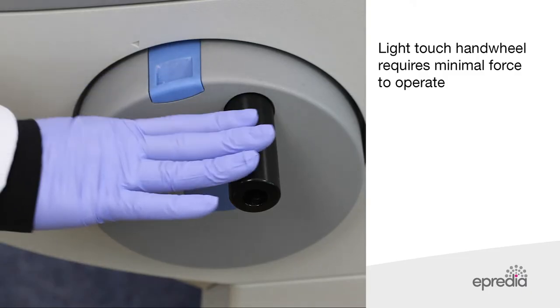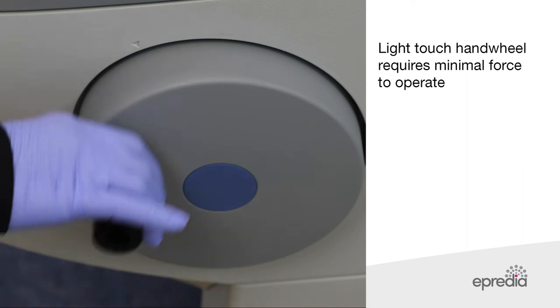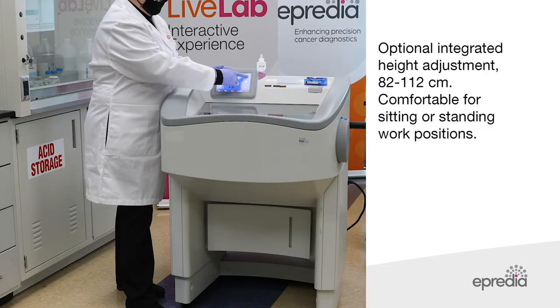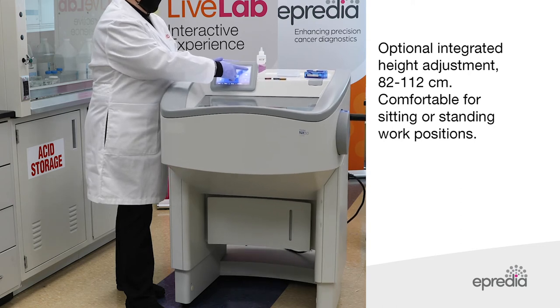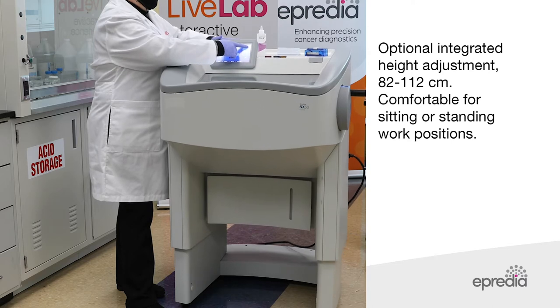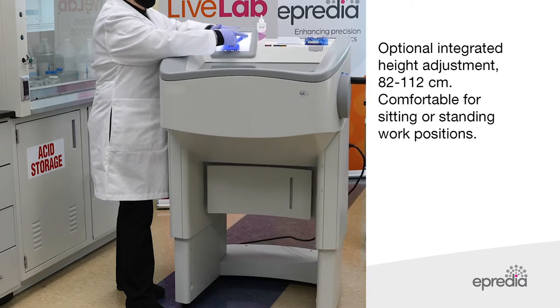The light touch handwheel requires minimal force to operate. The NX50 has optional integrated height adjustment which allows the user to work comfortably in either a standing or sitting work position with the touch of a button.